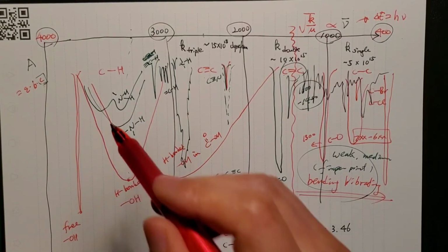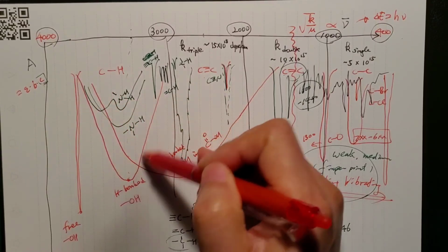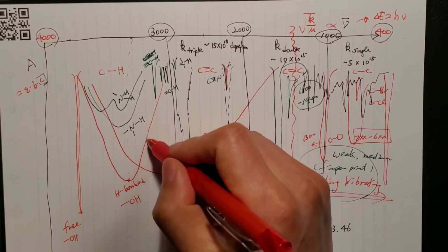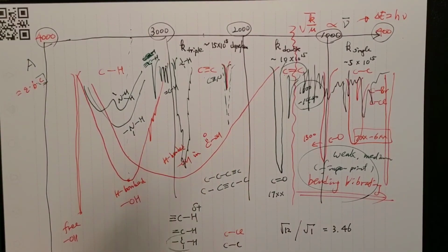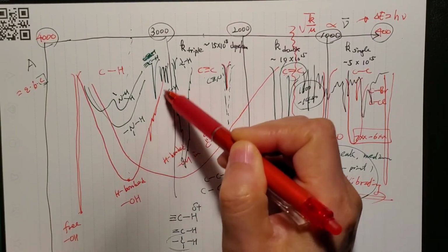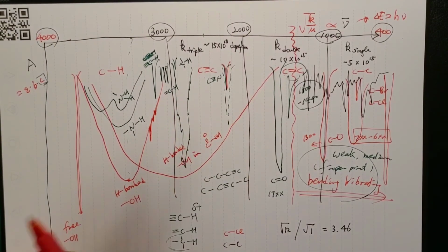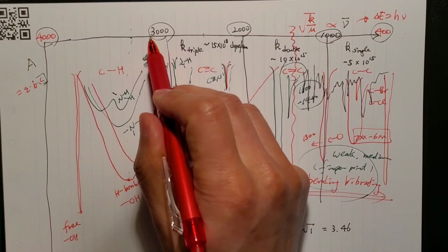So what happens is this: you're supposed to have a symmetric peak ideally, but you see some shoulders here. So you can imagine, ideally this broadness gives a symmetric broadness here, so this much of the signal is additional.